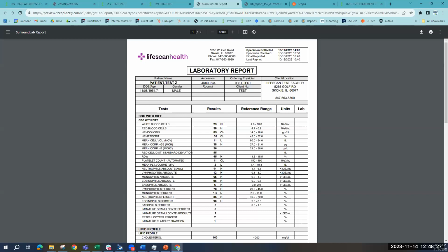I do not know that off the top of my head. I love questions that I don't know the answer to because I love learning. Daniel, do you have the answer to that? If not, then that is something we can definitely follow up on. Yeah, I think this is something that we need to double check, but as far as auto population, I know for sure you'll be able to populate it yourself. But as far as a default, that would be something that we can get back to you on.